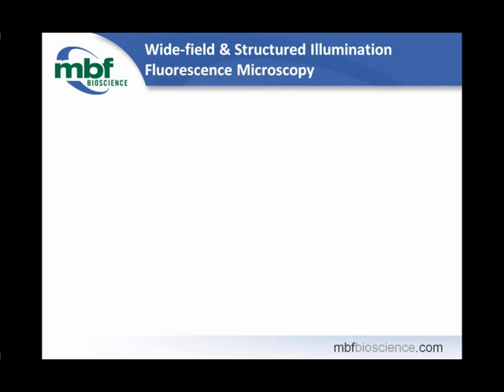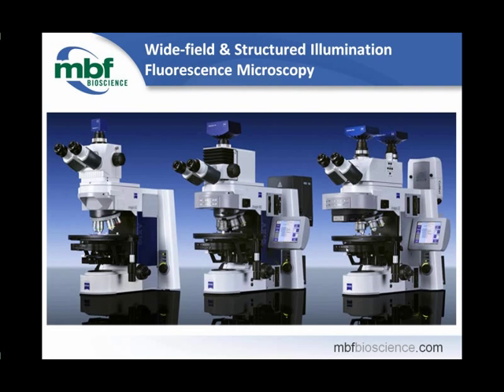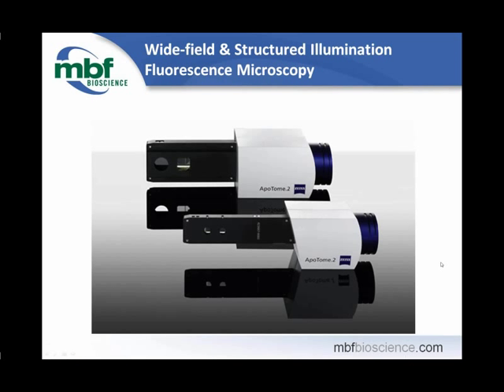That's right, Sue. And in situations where users try to perform stereology using wide field fluorescence, this can really become evident. Now, we've worked with ZEISS in the past to provide an integration with various types of their hardware. And what we found is that our users require more and more precision in X, Y, and Z to be able to identify their objects of interest.